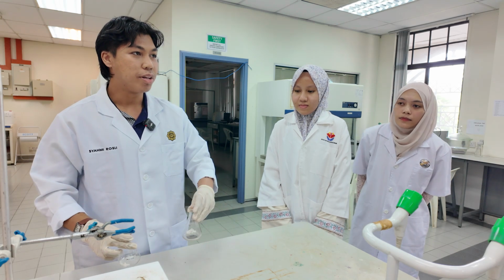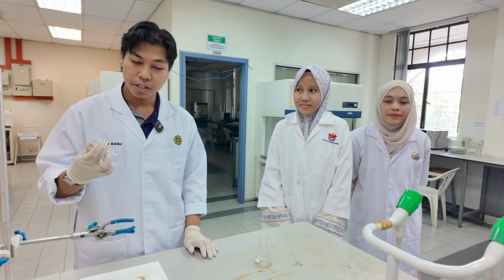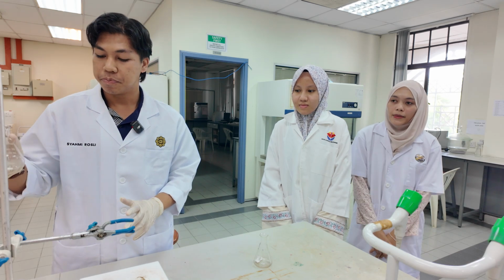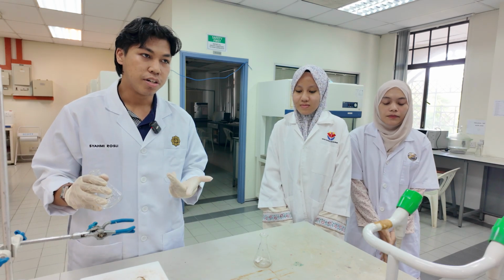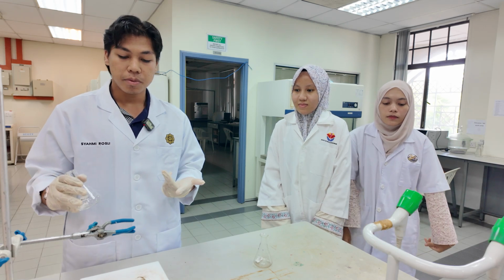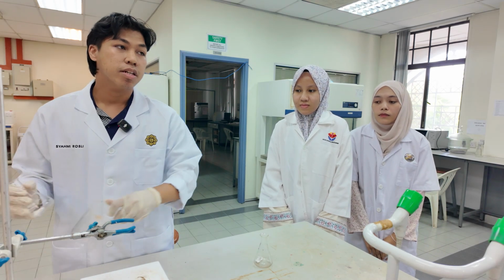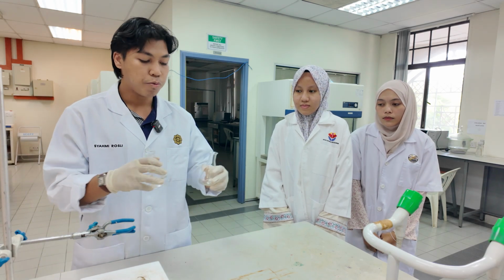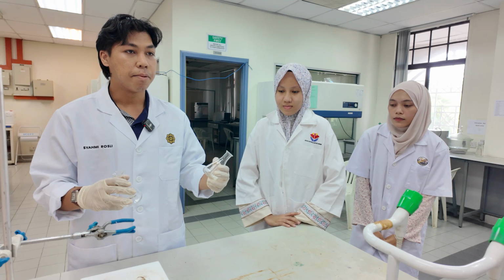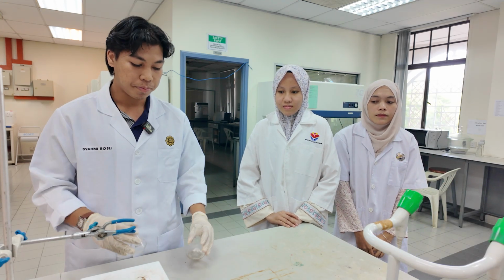Because we left the single flask at room temperature, but the mixture we put in the ice bath, so it doesn't happen naturally, because of the sudden drop in temperature. If we compare them both, the single flask is more beautifully formed.